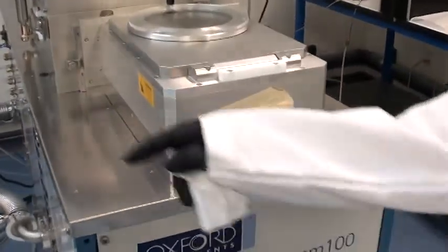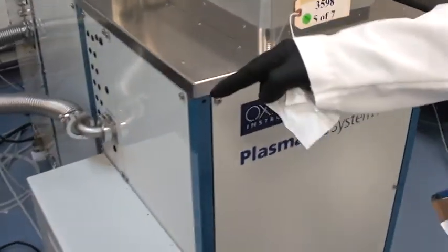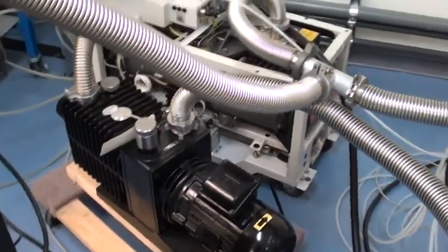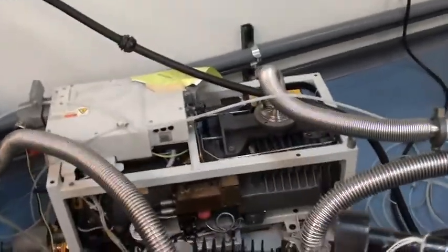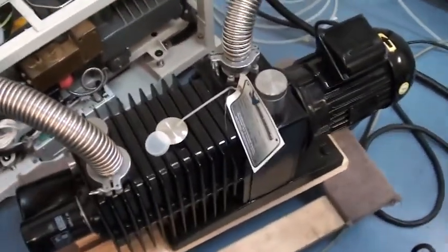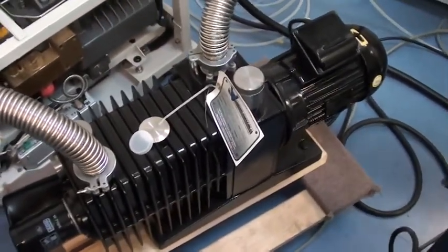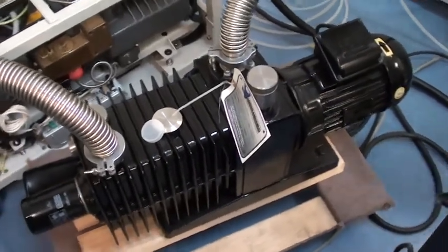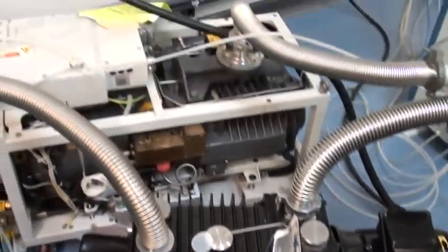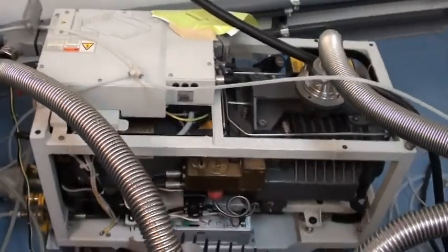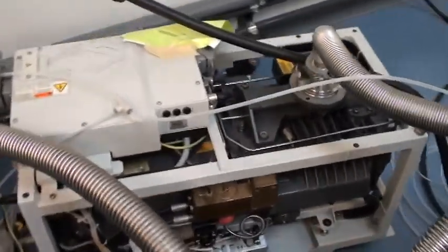We have the load lock pump, an AlkaSkyl 2033 backing pump wet pump. We have an Edwards IQDT80 backing the turbo for the chamber.